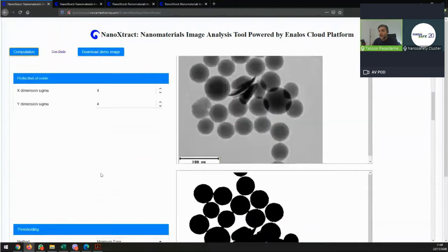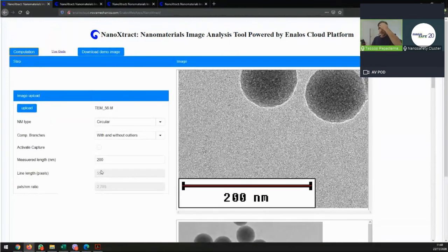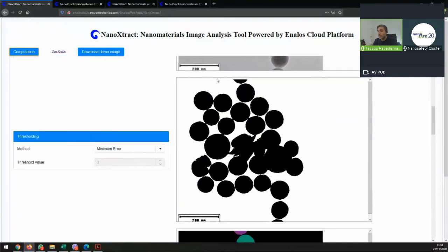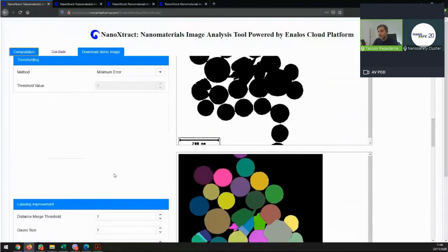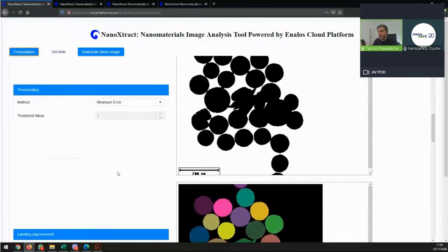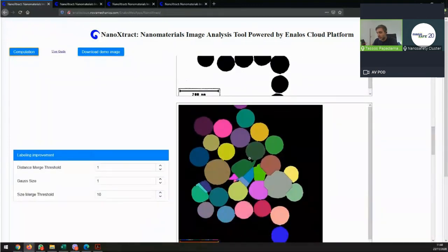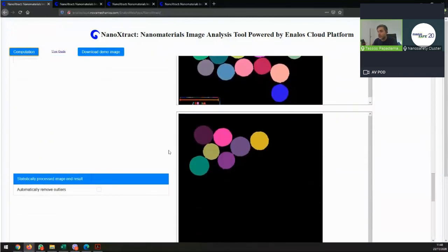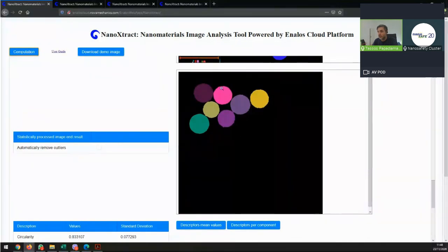Yes, I'm sorry, I think the tool was stuck. That's why it was not working. So here you can see now that we have a pretty good, clean inverse of the image. You can see here that it identifies things. Here is the part that's the most problematic, and eventually we get, let's say, part of the images of the particles here.